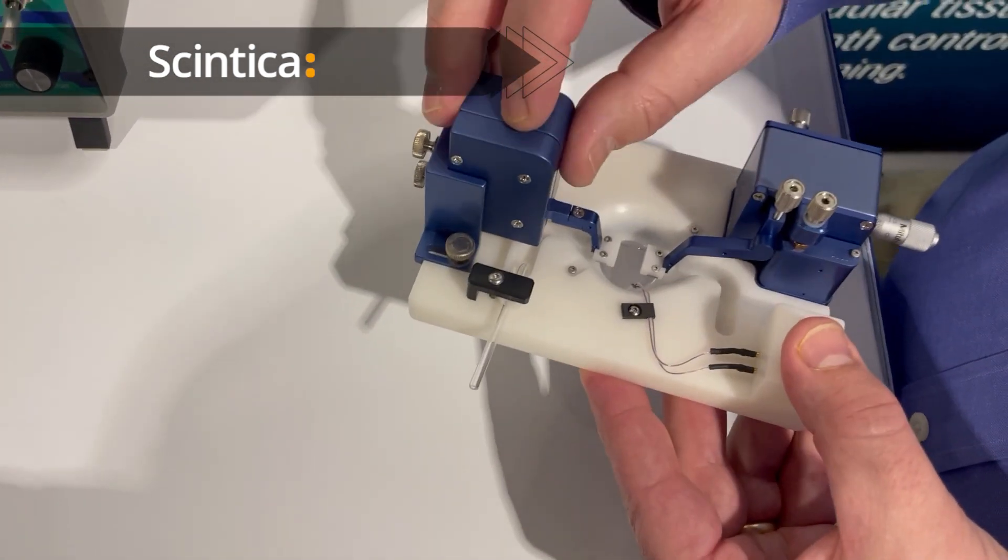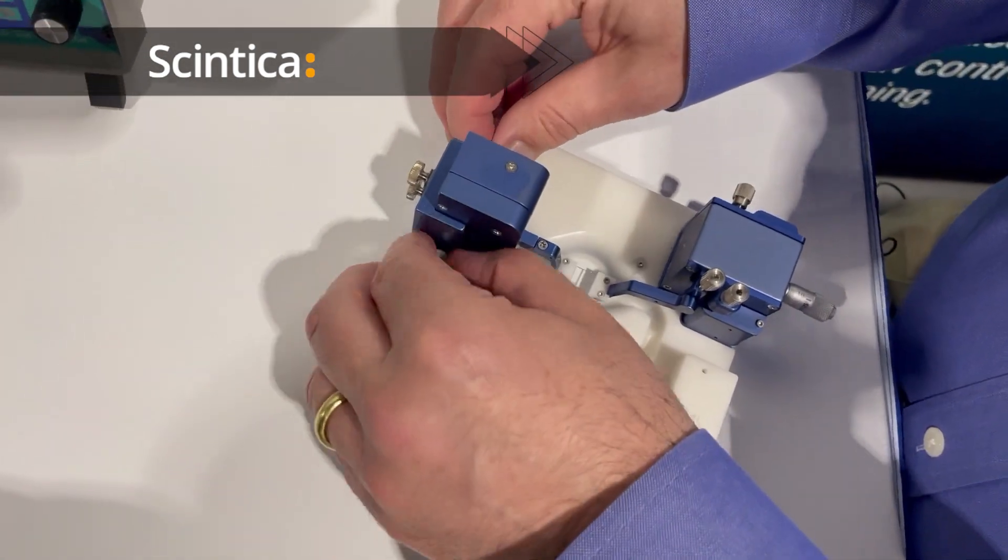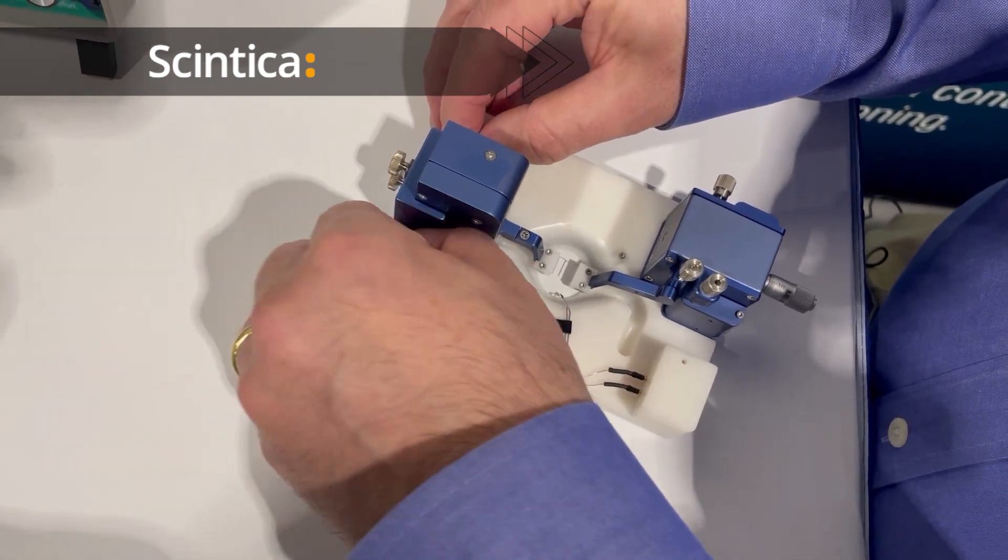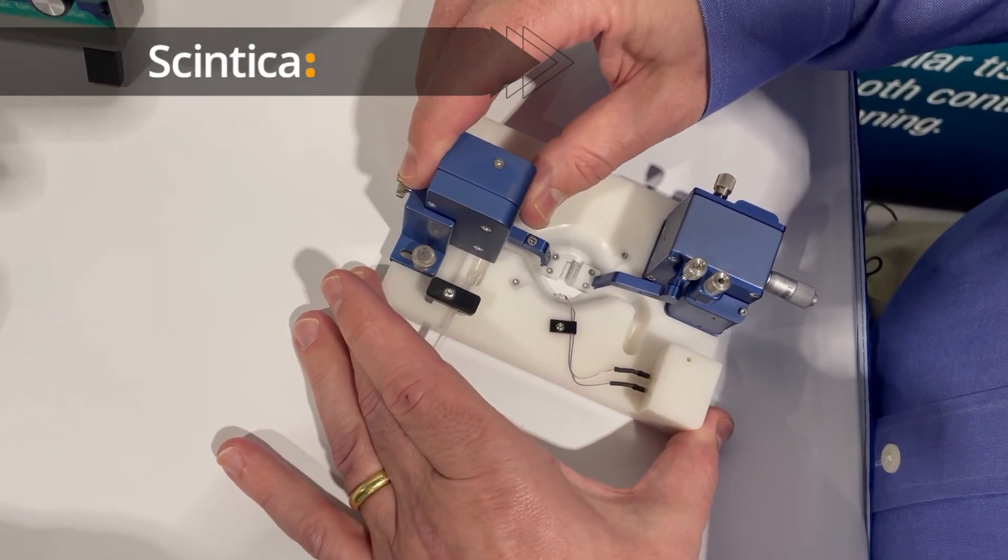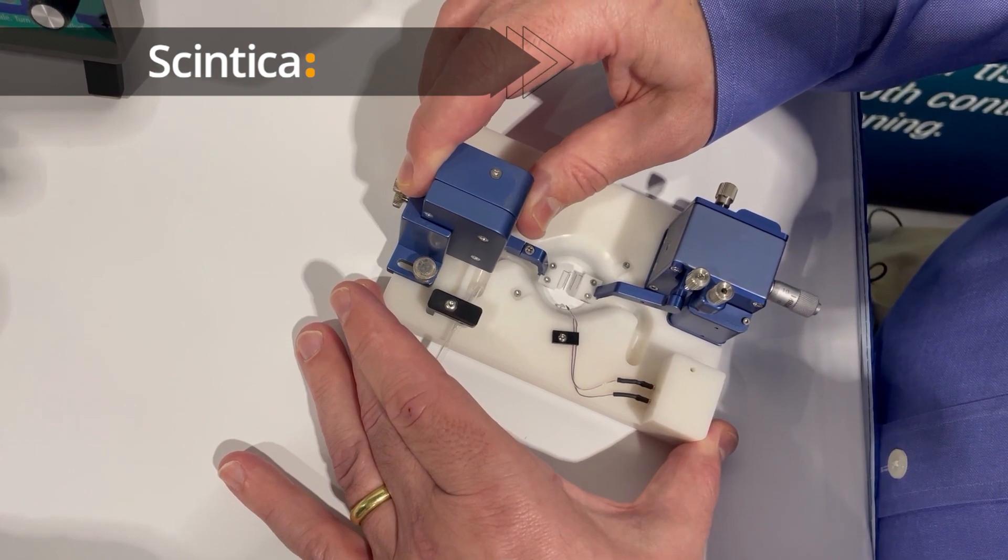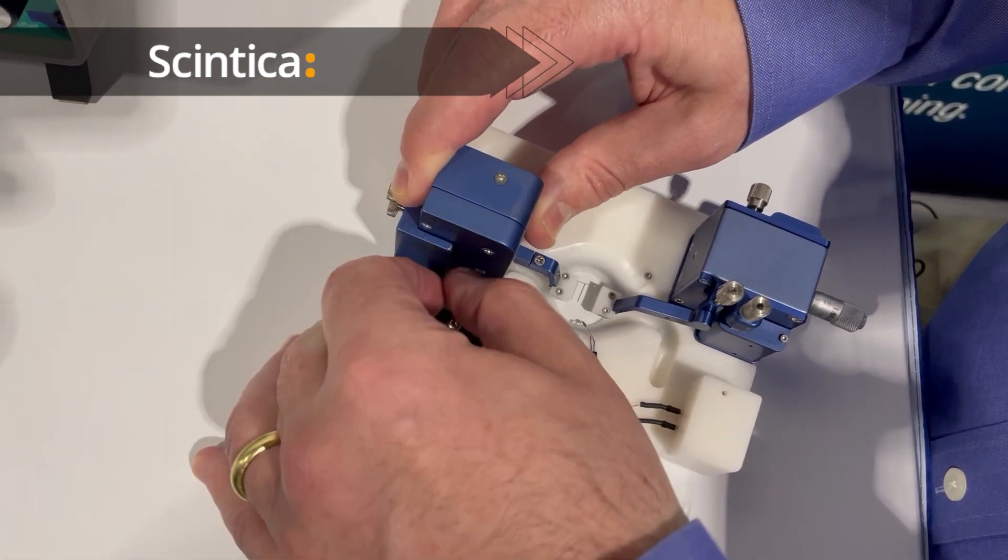The force transducer sits in this housing here and can be moved back and forth depending on the size of the specimen that's being studied. So you get some adjustment there.